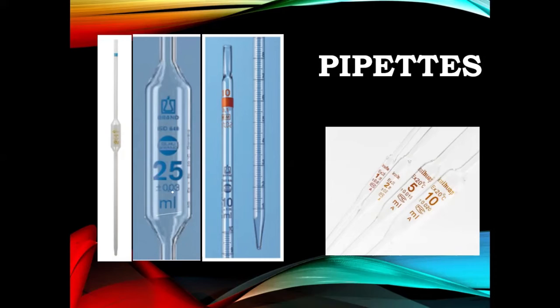And its accuracy is 0.03. And the accuracy of this pipette could be 0.01, or 0.01 is the accuracy for most of the pipettes. So it can transfer only one volume, but from this pipette, you can measure any of these volumes.